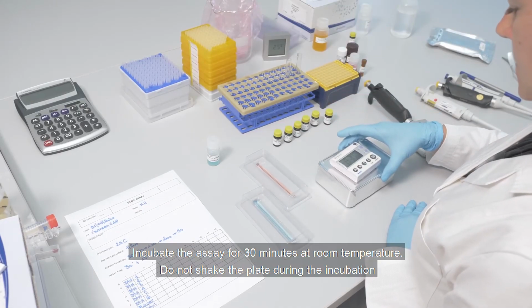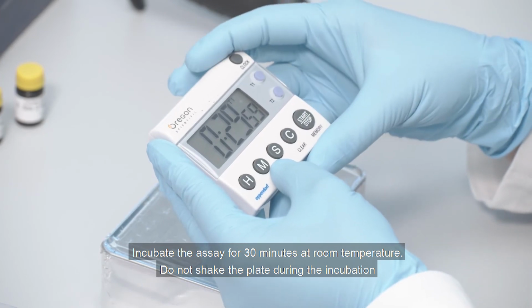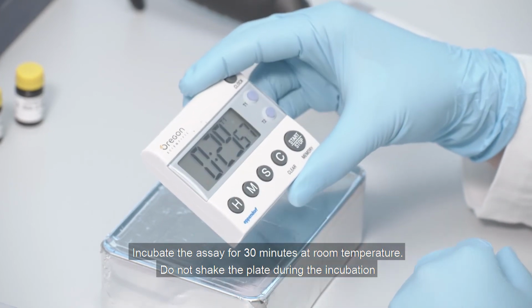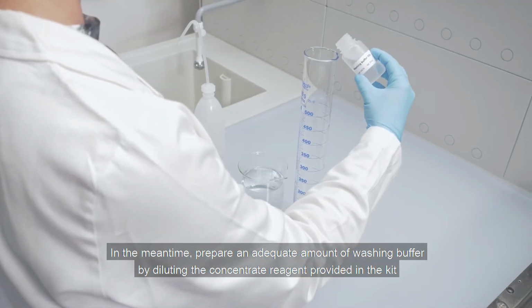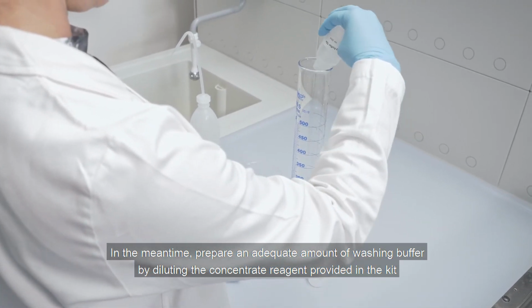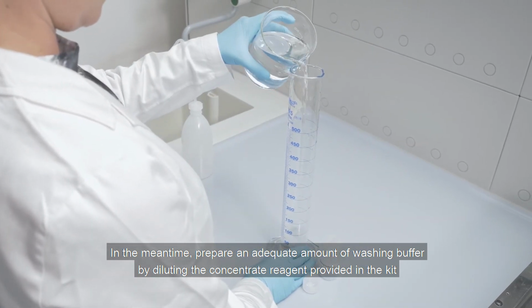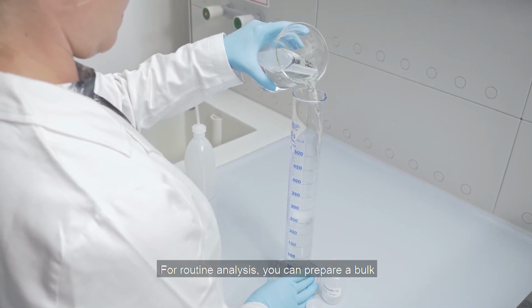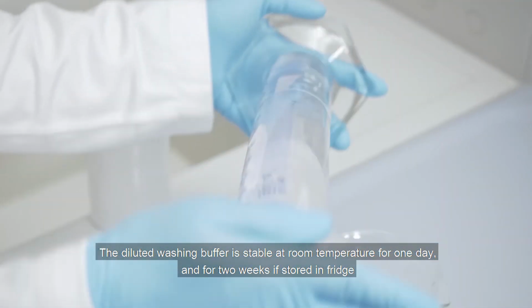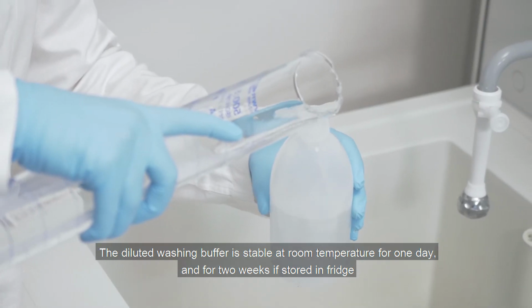Incubate the assay for 30 minutes at room temperature. Do not shake the plate during the incubation. In the meantime, prepare an adequate amount of washing buffer by diluting the concentrate reagent provided in the kit. For routine analysis, you can prepare a bulk. The diluted washing buffer is stable at room temperature for 1 day and for 2 weeks if stored in fridge.